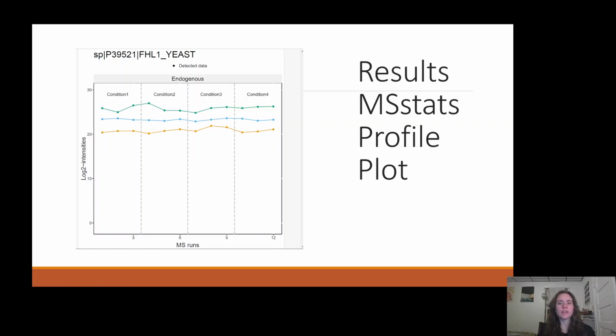It's pretty common that a replicate might fail in the mass spec because of the mass spec malfunctioning, or there's some sort of issue. But in this case, it looks good. This kind of plot would tell you that maybe you need to run the experiment again, or you can't really trust this data because one of the replicates does not look good.